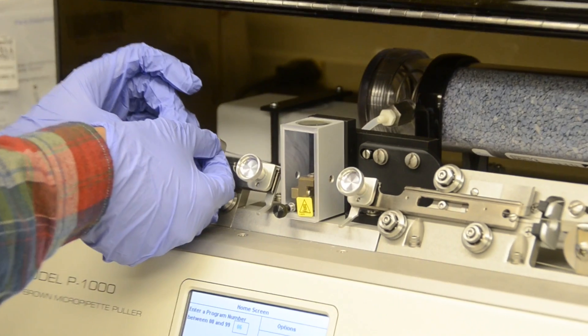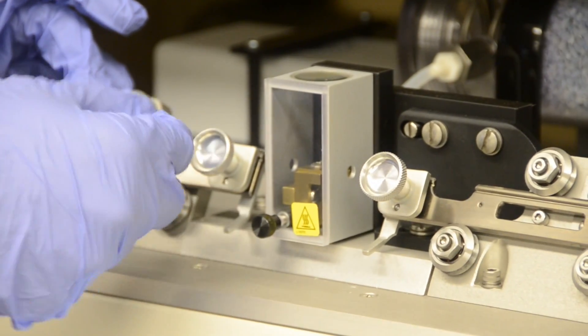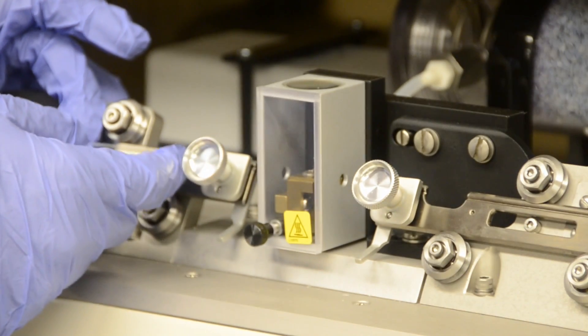Slide the capillary tube through the silver filament within the box at the center of the machine. Be careful not to break the capillary tube.